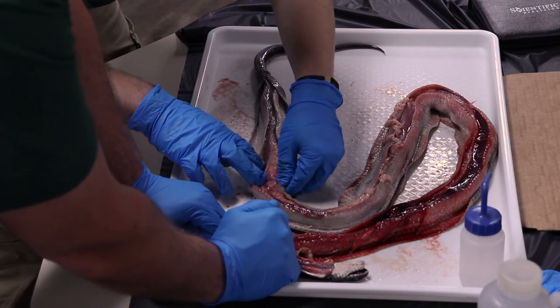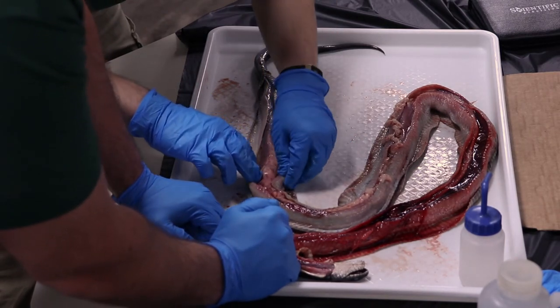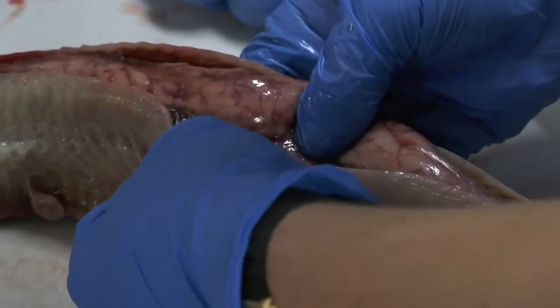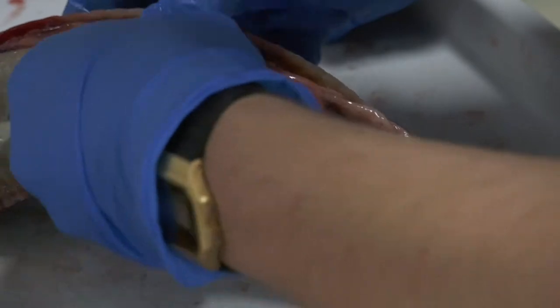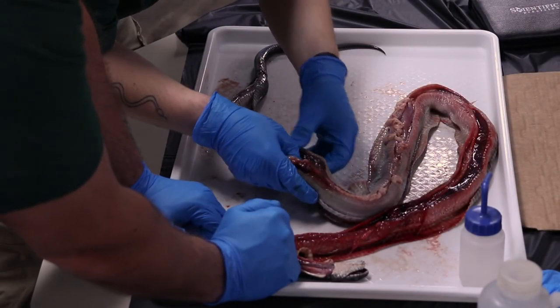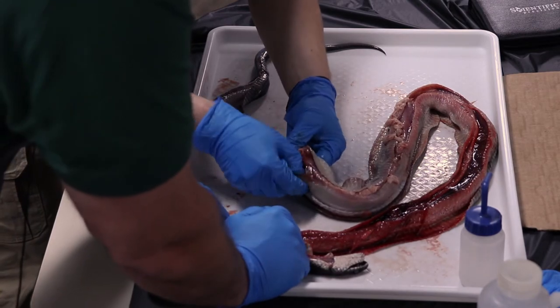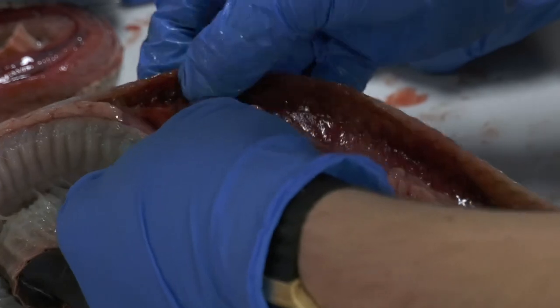There should be a kidney around here somewhere too. But do they have paired kidneys? I believe there's just one. Just one kidney. It's probably underneath some of this stuff. Pull it out if we need to. There's also a gallbladder around here somewhere. There's something.